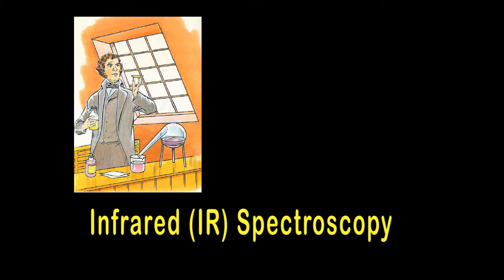Good day, welcome. Here we can study infrared spectroscopy and how to interpret the IR spectroscopy results. What is IR spectroscopy and why understand its results?